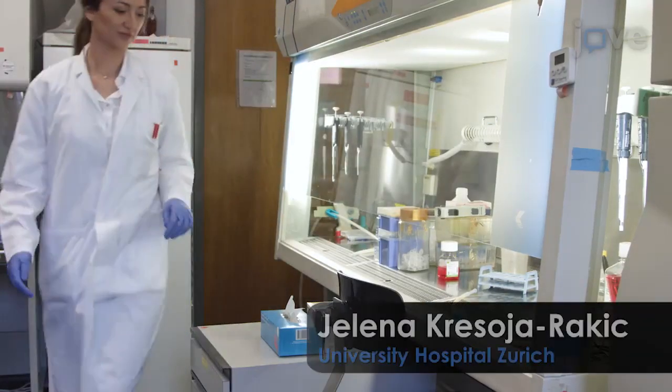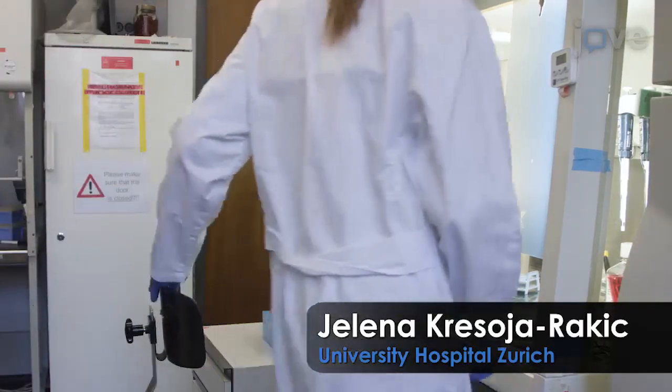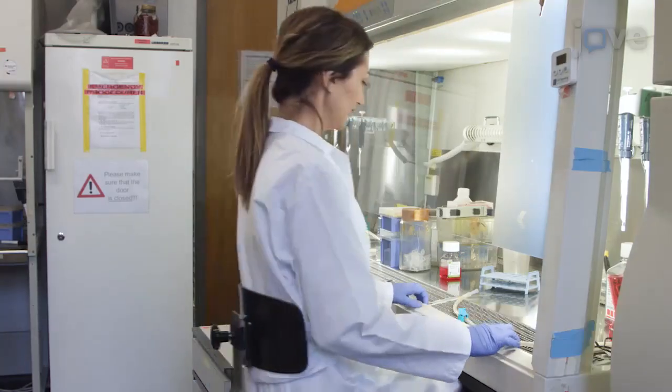The main advantage of this technique is that it complements functional characterization of stabilizing or destabilizing elements assessed by reporter assay. Demonstrating this technique will be Dr. Jelena Kresoja-Rakic, a postdoc from my laboratory.